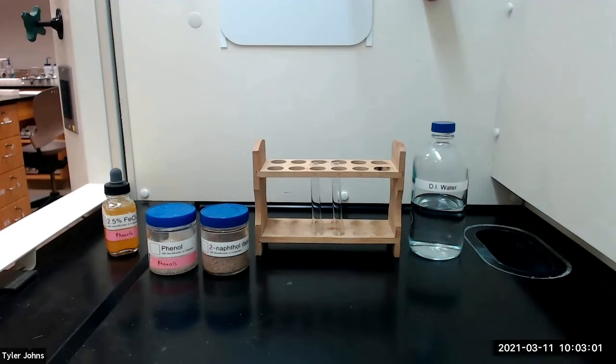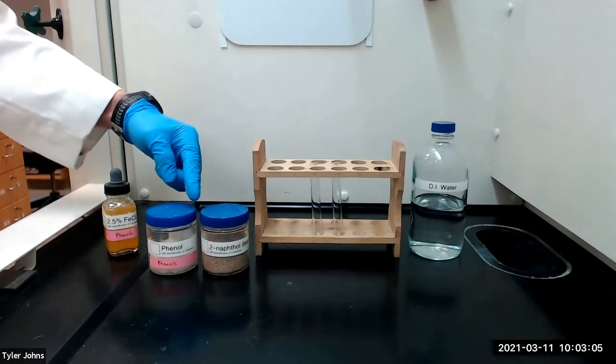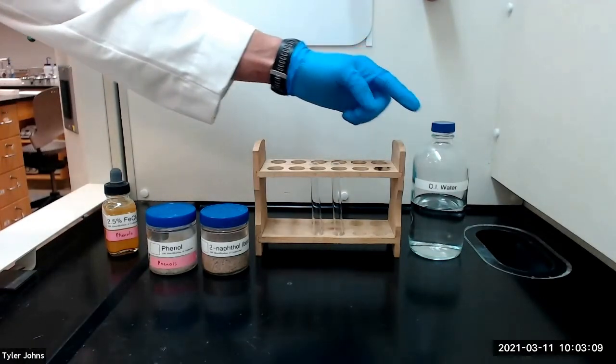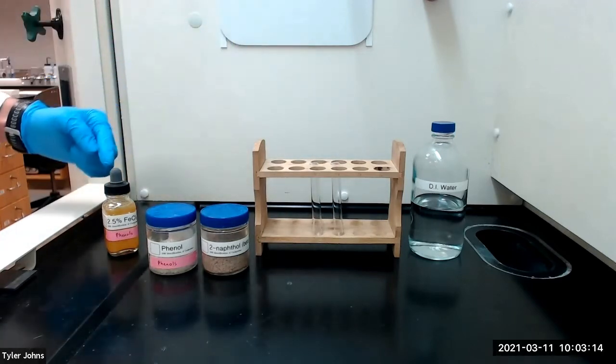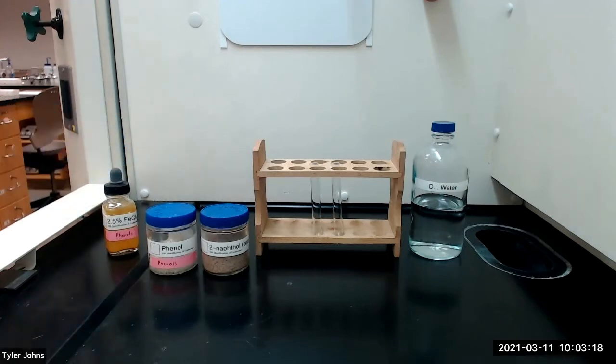We will begin by adding a small amount of the test compounds to separate test tubes. We will then add 1 milliliter of deionized water to each test tube and mix with a micro spatula. We will then add several drops of 2.5% aqueous ferric chloride solution.